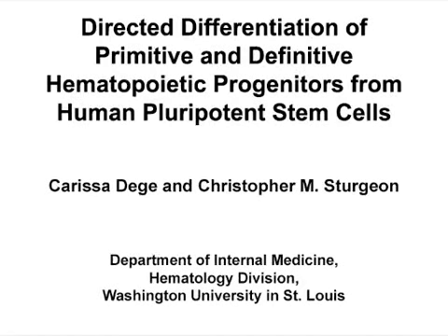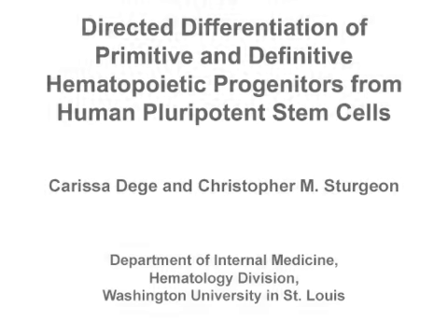The overall goal of this method is to direct the differentiation of human pluripotent stem cells toward the primitive or definitive hematopoietic program using a stage-specific signal manipulation approach. This method can address many key questions in the field, such as understanding the signal and transcriptional regulators of human definitive hematopoiesis. The main advantage of this technique is that it uses stage-specific manipulation of Wnt signaling.